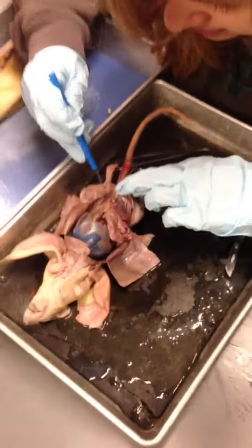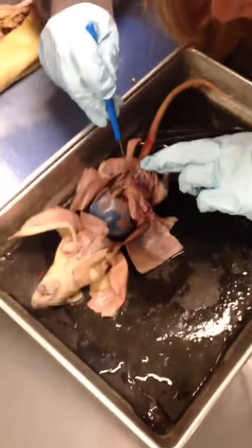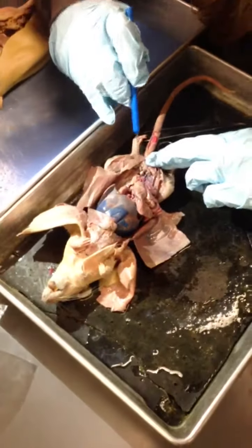The female's pretty easy. So here's your urinary bladder. Okay, so here's your urinary bladder. This is the body of the uterus. This is the uterine horn.